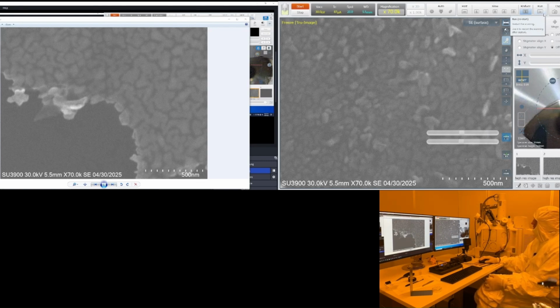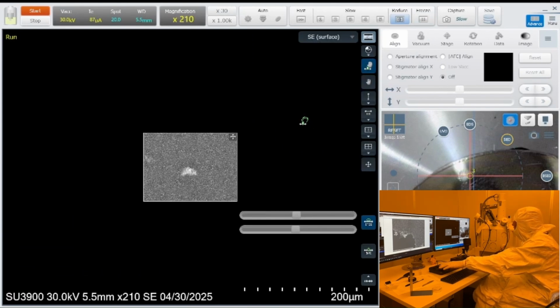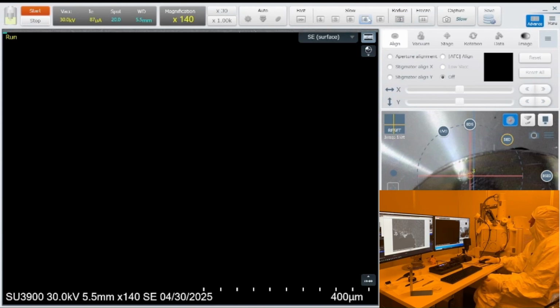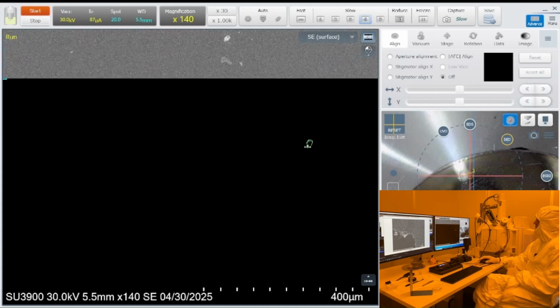You can look at the gratings to see if the light on the gratings is, again, because even though it's a film that is continuous, the fact that it's present on different surfaces may be changing the grain sizes.